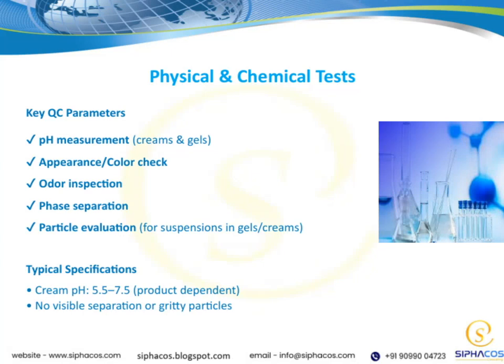Now, let's take a closer look at some of the key physical and chemical tests we perform to ensure product quality.